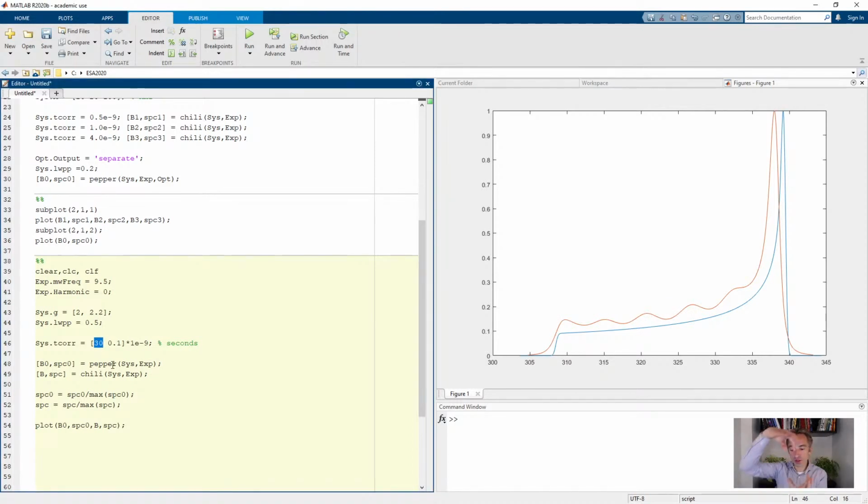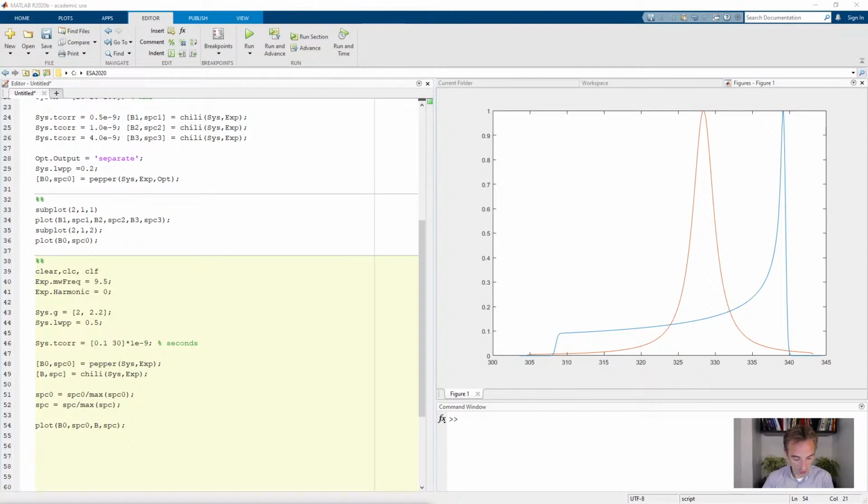If the molecule tumbles around the z-axis, it's just swapping the x and the y values all the time. The z is staying the same. But x and y in this molecule are the same, the g values are too. But what now if we change it the other way? We're going to let it not tumble around the z-axis, but tumble quickly around the x and the y-axis. If you tumble around the x and the y-axis, you're going to swap the z value with the x value. And then we should see a huge effect. And voila, you see a lot of averaging. So this is how anisotropic diffusion works.